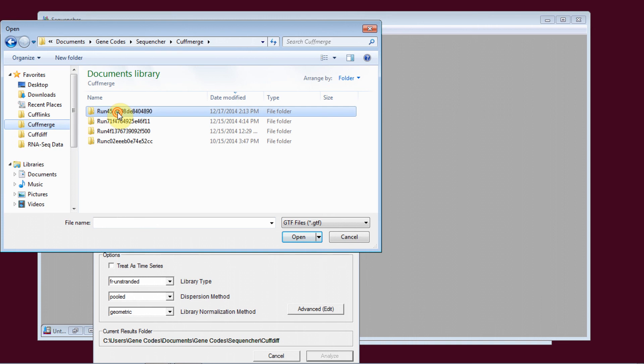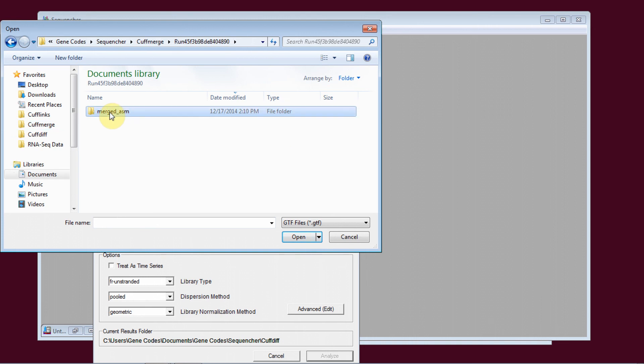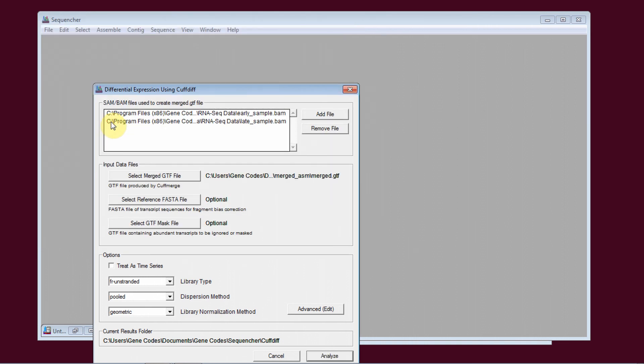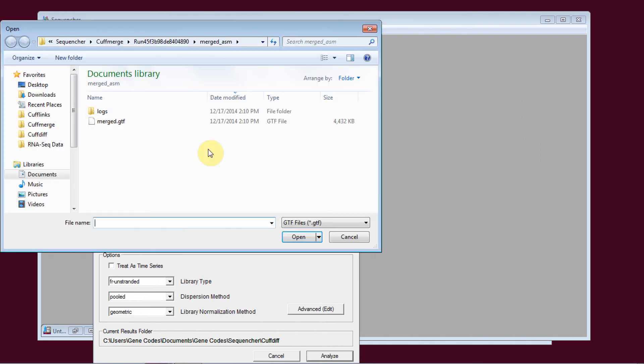I select the merged file from CuffMerge. I know that this was the run whose merge file I'm interested in using. But again, if I wasn't sure, I could go back to the external data browser to confirm that.